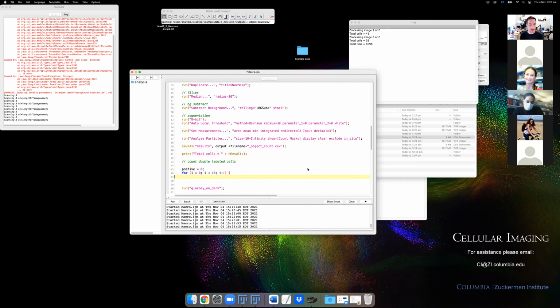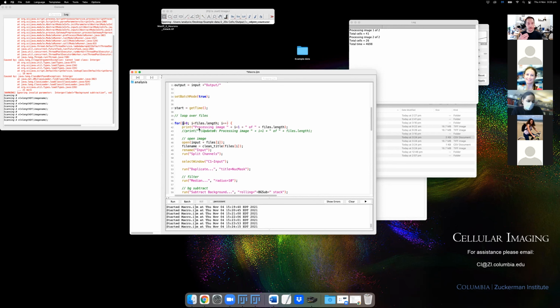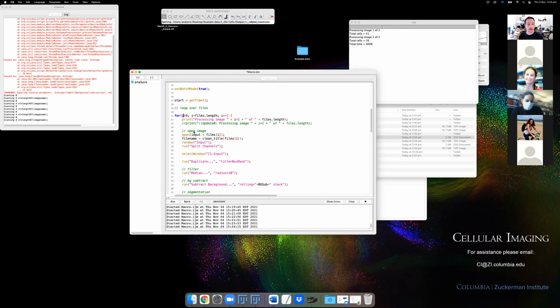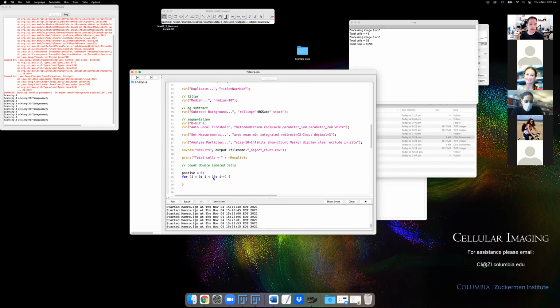It's really important, if you're making another for loop, not to use the same variable that you used in the loop up here. Otherwise, there'll be some interaction and it's going to get very confused. If you're using loops inside loops, this is a really common problem that people run into. Just change this to something else. You don't have to use letters either. You could give it something that you could remember more easily, like row or whatever. It doesn't have to be just single-letter variables. And I'm just going to change these all to j.